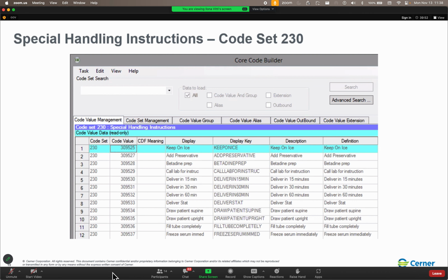All right. So now let's bring those accession assignment pools back into play. Because part of the point of having these accession site prefixes is that we can create different accession assignment pools for them to pull their accession numbers out of. So we could have one pool for our model experience hospital, and we could have a different pool for our baseline hospitals.